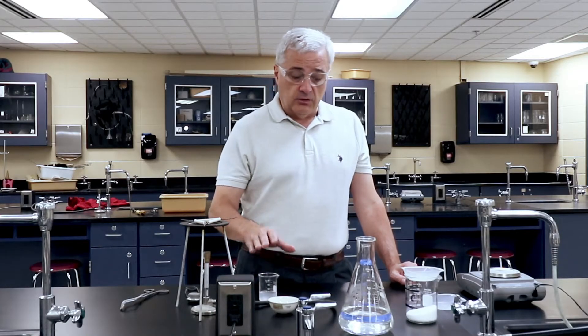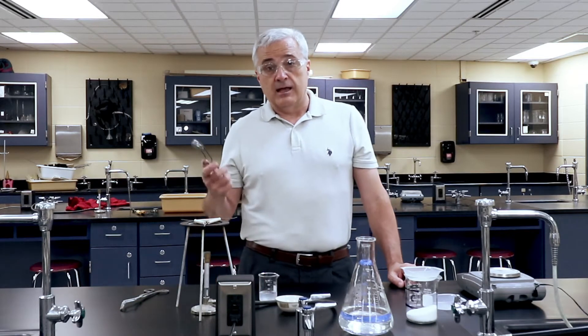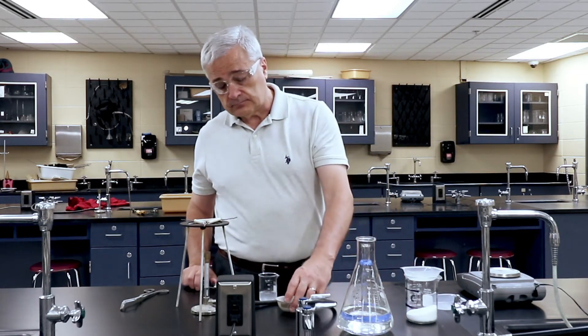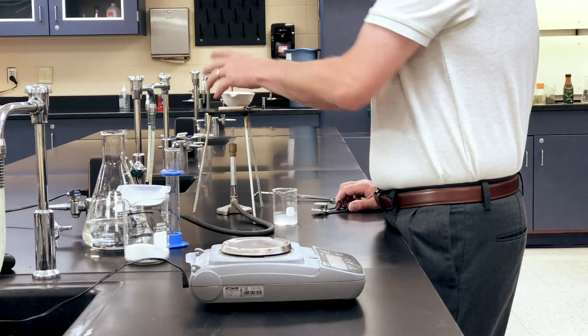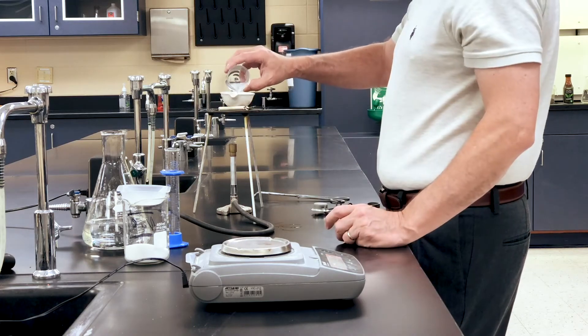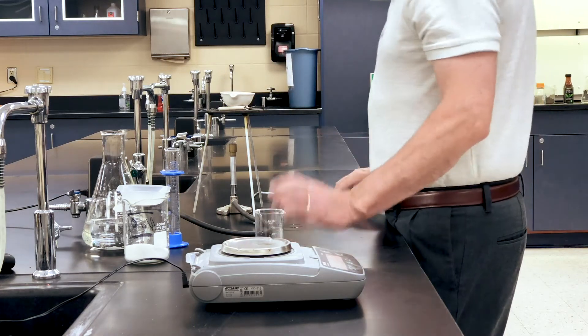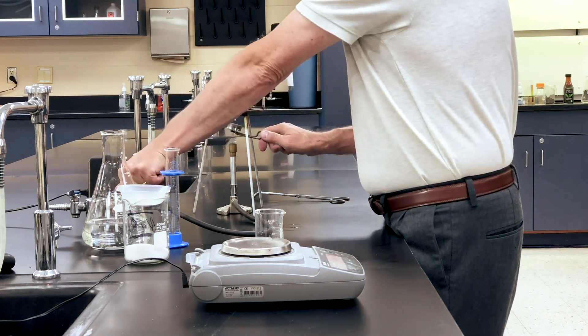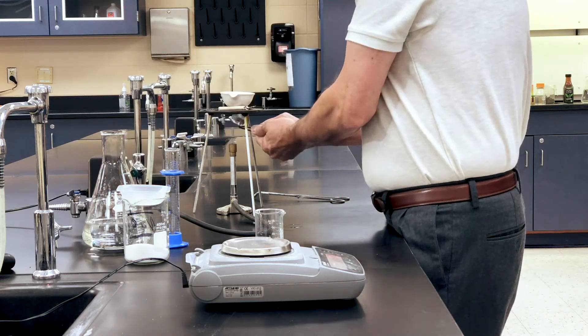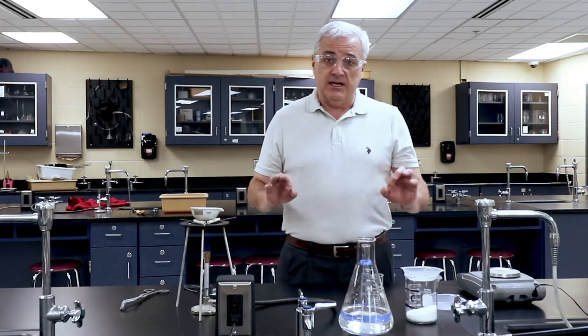So now I have a solution of sodium chloride. I have an evaporating dish. I have a Bunsen burner. I'm going to go ahead and put the solution in the evaporating dish so I don't have to put my hand over the fire. My solution is now in the evaporating dish. I'm going to light the Bunsen burner — and now the Bunsen burner is lit. That is the setup for this experiment.